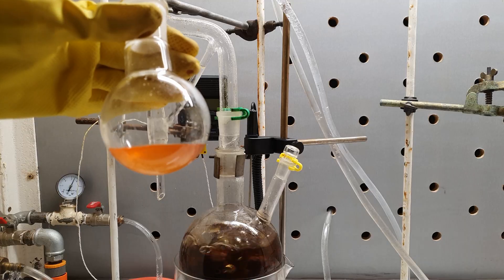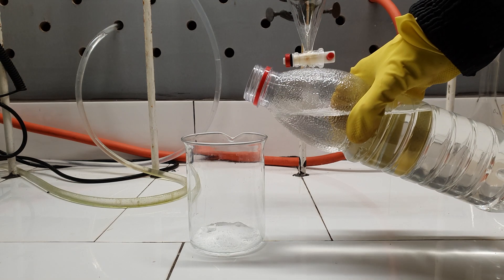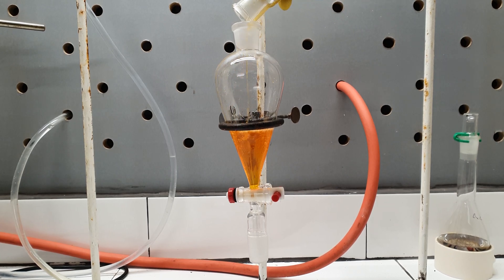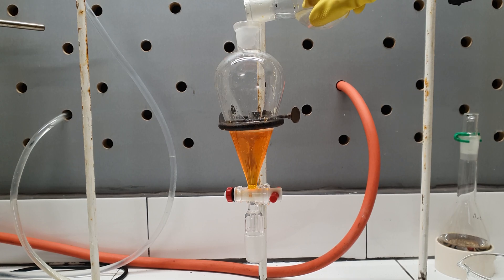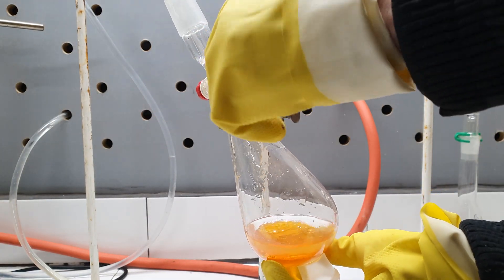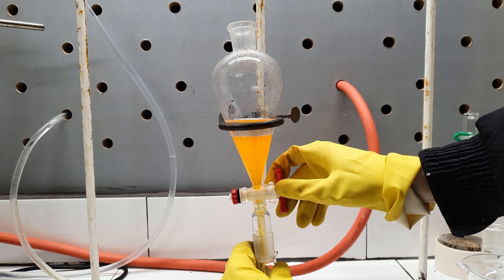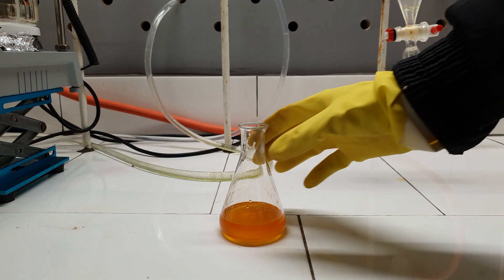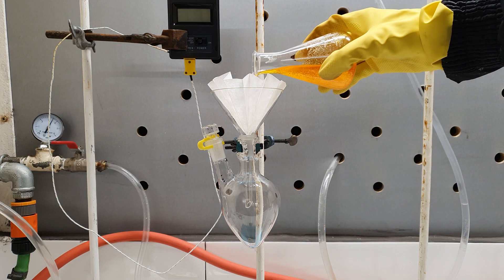I didn't really like the color of my product, so I decided to wash it, assuming the color came from iodine impurities. I prepared some dilute sodium thiosulfate solution and added it alongside the iodobenzene in an addition funnel. I kept shaking and venting the funnel, but this did nothing to the color, so I decided to proceed with the next step. I transferred the iodobenzene into an Erlenmeyer flask and added some anhydrous sodium sulfate to dry it. After standing for a while, the salt was filtered using filter paper.